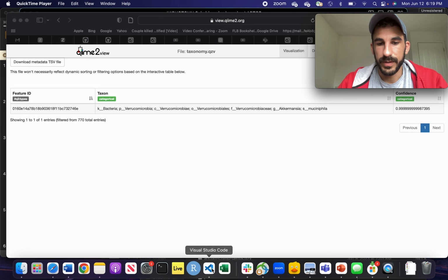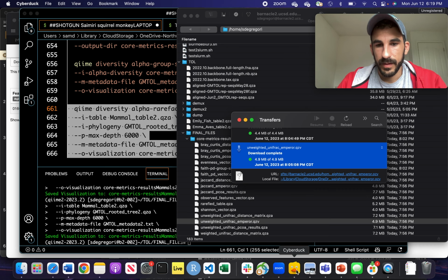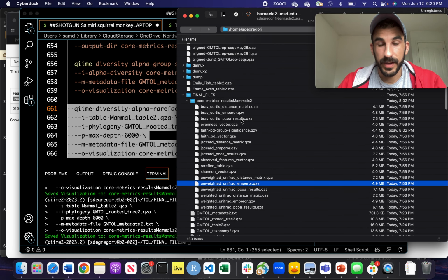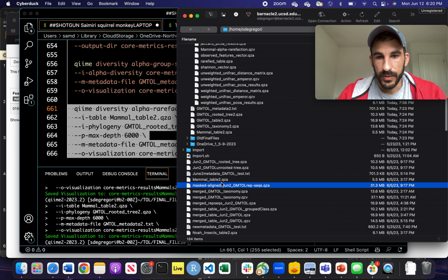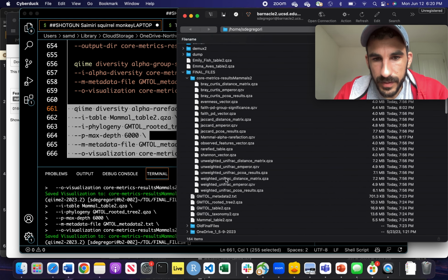All right, so it should be done by now. Cool, it's done. Let's quickly download it just to see, because I'm actually curious. I haven't done this before. Am I missing something? Where is it? Alpha. Am I verified?